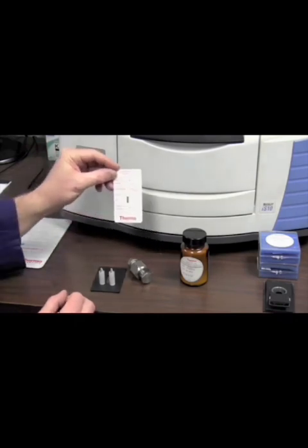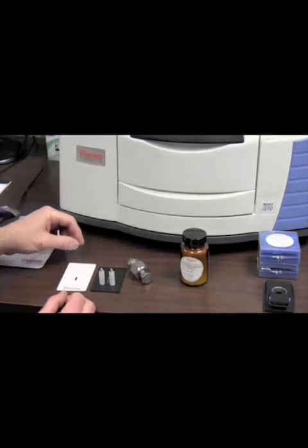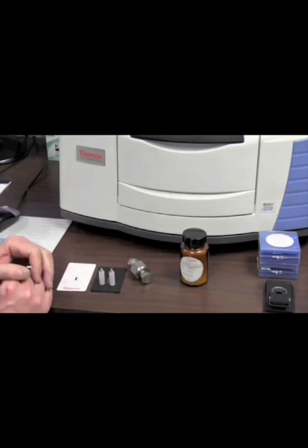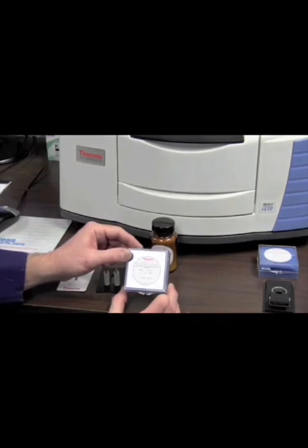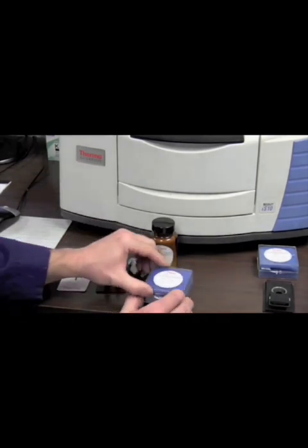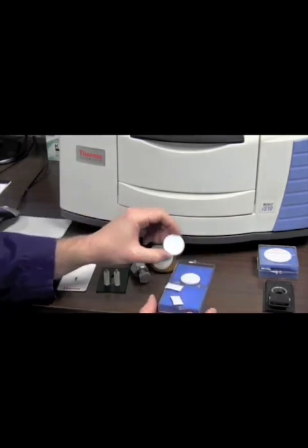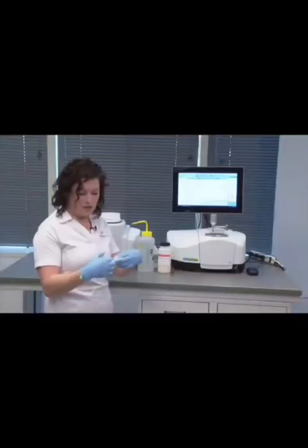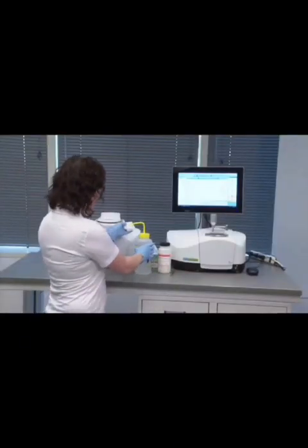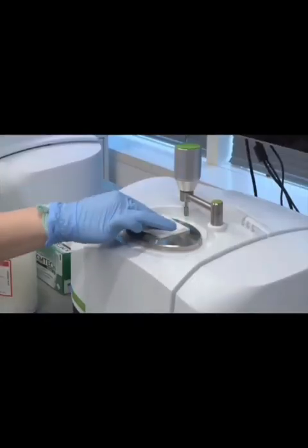The samples that we chose, for example, are from tropical trees, which are fresh leaf (FL), oven dried leaf (DL), and heat dried ground leaf using a mill (GL). The sample then needs to dry for a few hours. Then the samples are pulverized into small pieces. During the operation, the surface of the clamp and crystal surface must be cleaned using ethanol for each use before changing to another different sample.